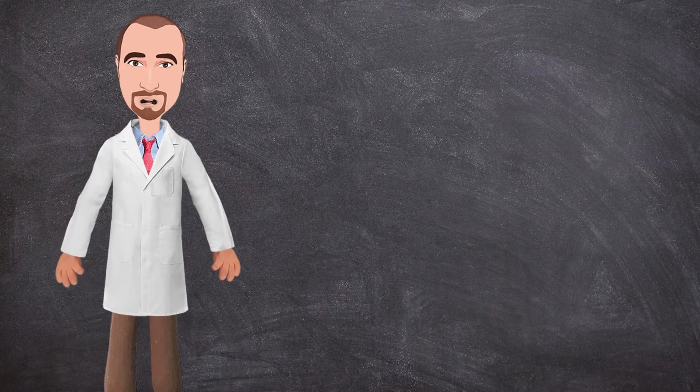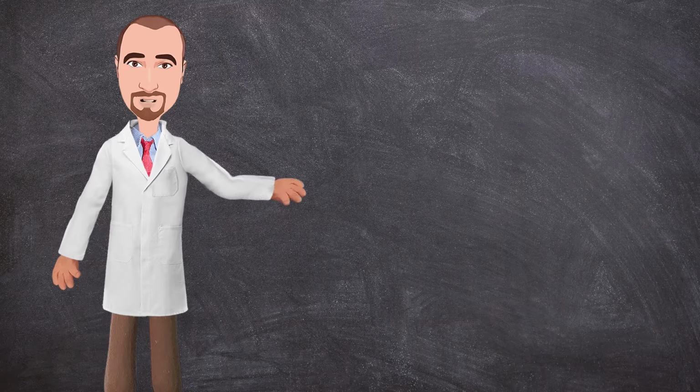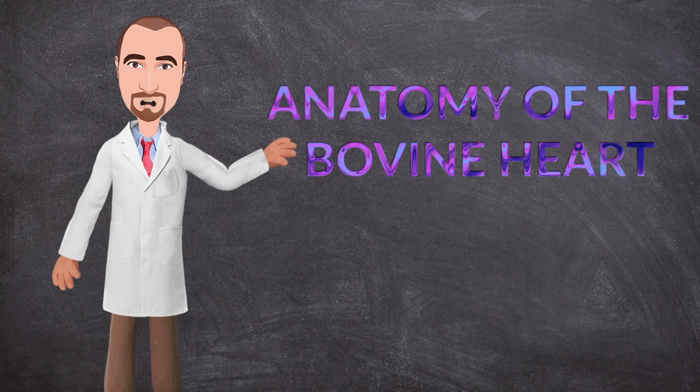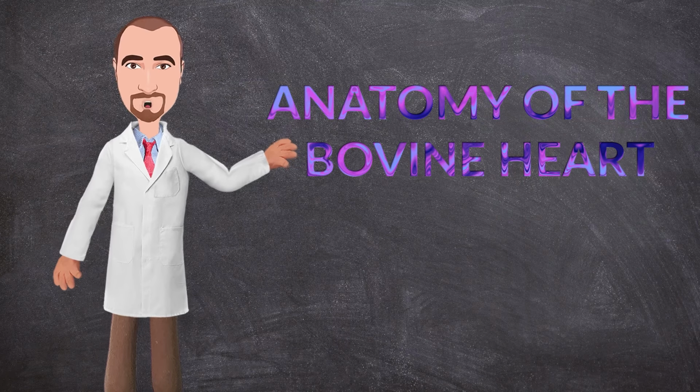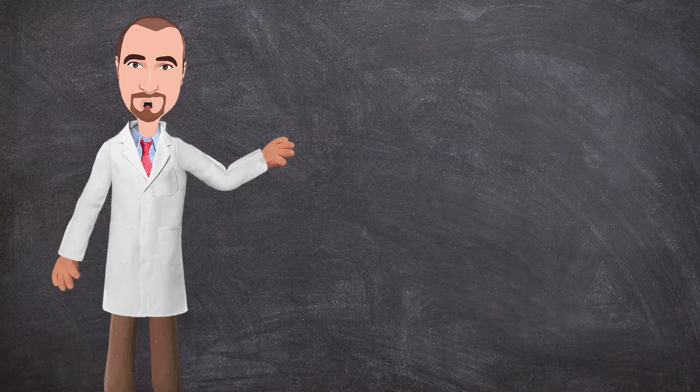In this video we will dissect the bovine heart in detail and talk about the main arteries coming from the heart. So let's get started.